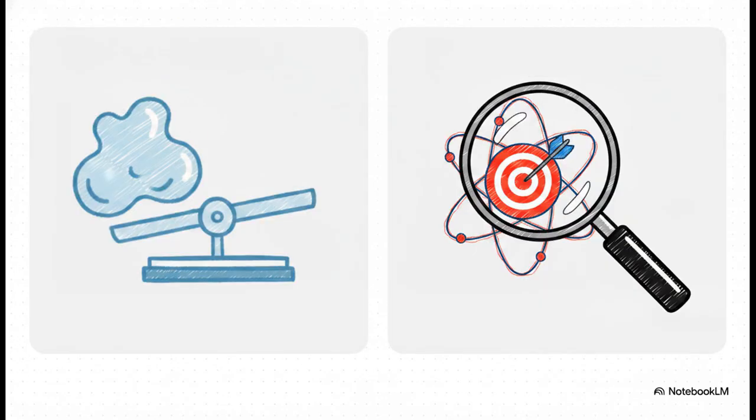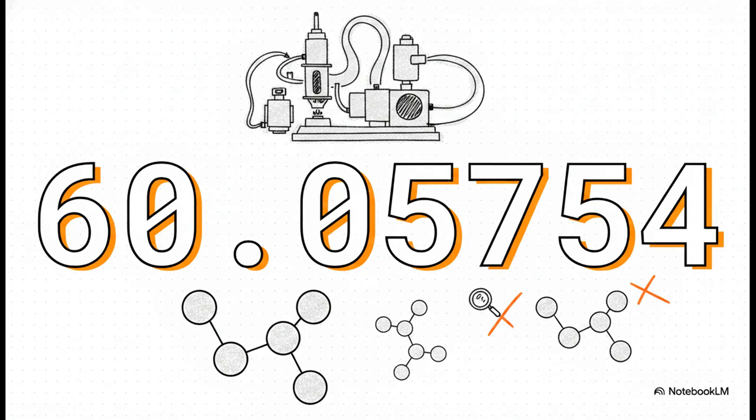So what's the fix? Well, the crucial point here is that we absolutely must move away from the whole numbers of nominal mass and utilize something a lot sharper, which is precise mass. You see, nominal mass uses weighted chemical averages, like just rounding carbon to 12. But the precise mass? That takes the actual exact mass of an element's most common isotope, stretched out to several decimal places. By zooming in on the mass to that extreme degree, we can finally shatter this illusion and tell our molecular suspects apart. The ultimate solution is running our mystery sample through a high-resolution mass spectrometer.